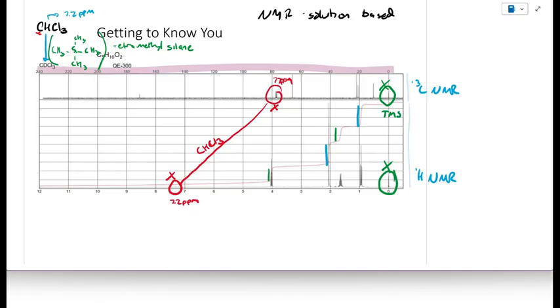So how do I know how many hydrogens are represented by that signal? We can eyeball it. As I look at this signal on the right, it starts here at this horizontal grid line, and that's why these horizontal grid lines are on here actually. And it looks like it goes up to about 2.5 blocks. So we can say that this vertical line represents about 2.5 blocks vertically. And if I look at this one, it starts here at this block and goes down to about here.